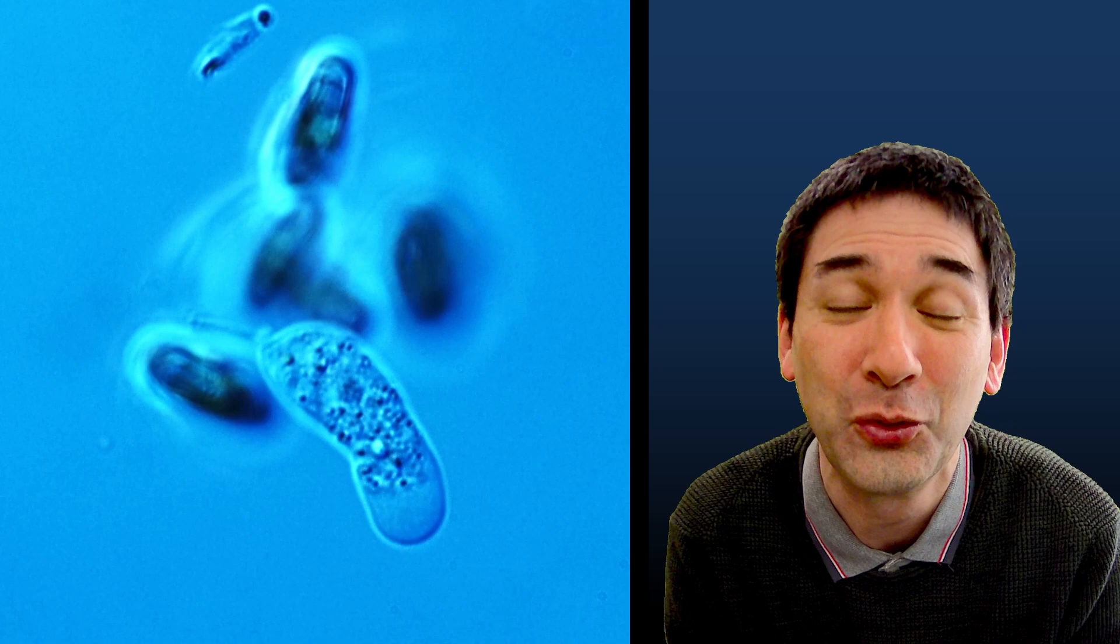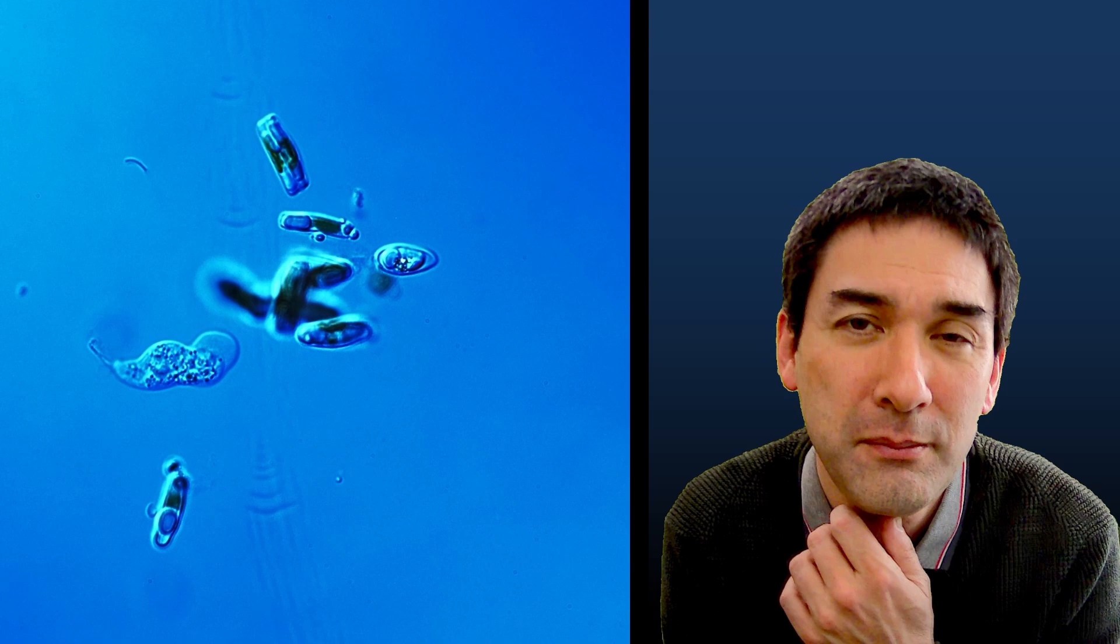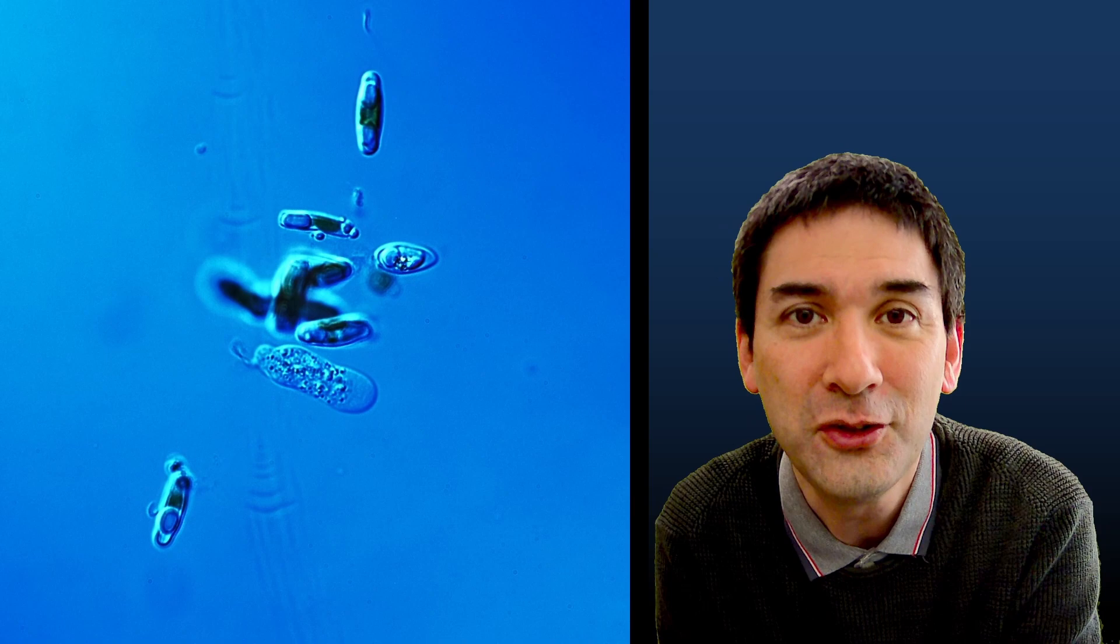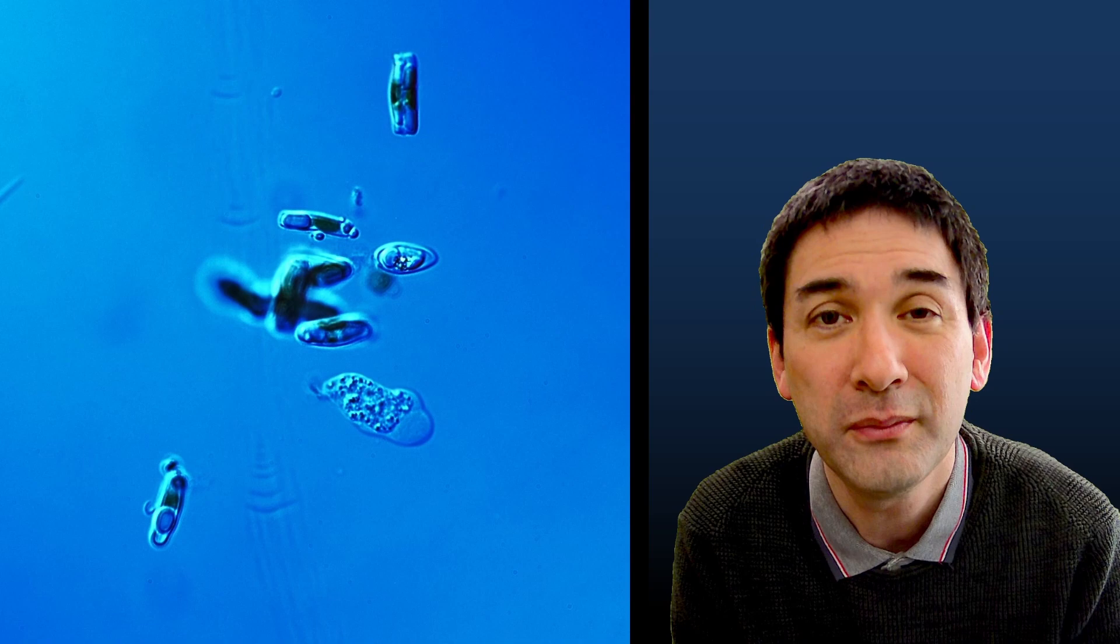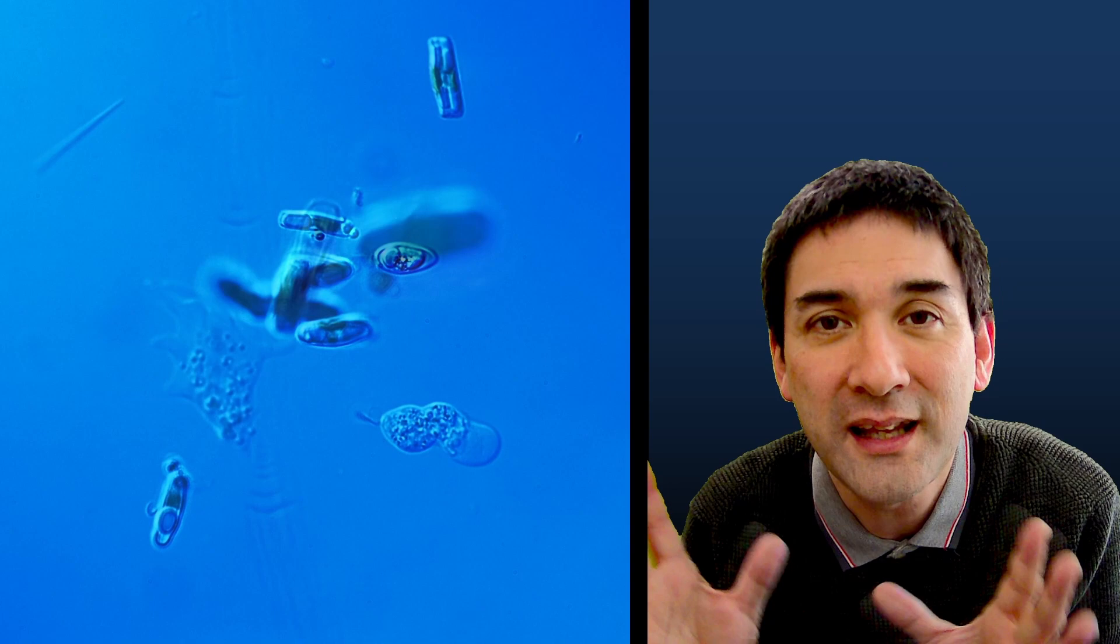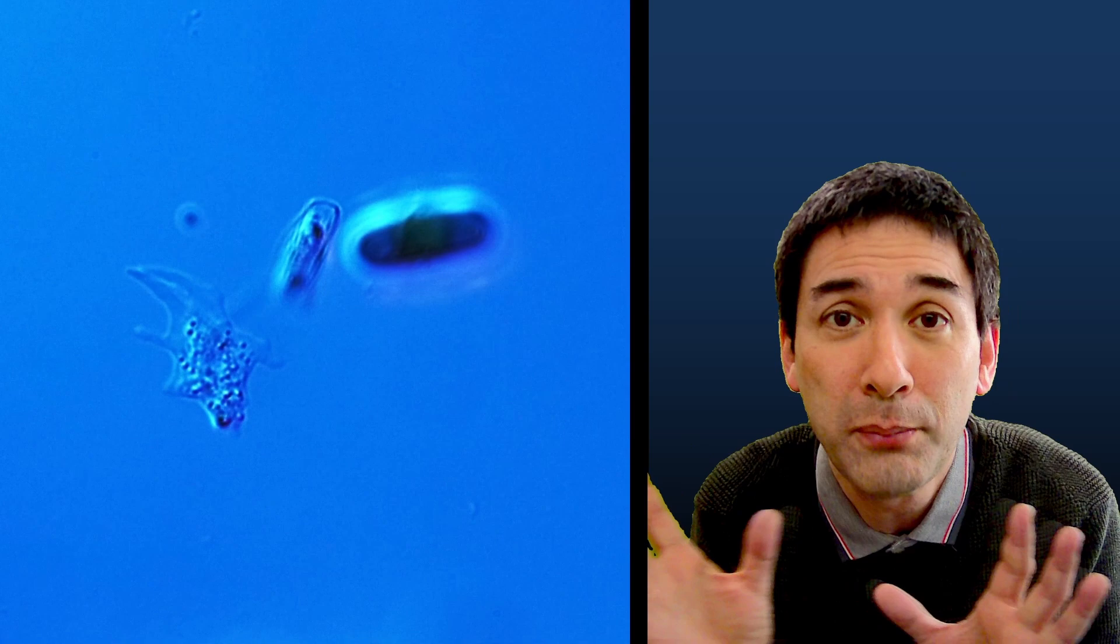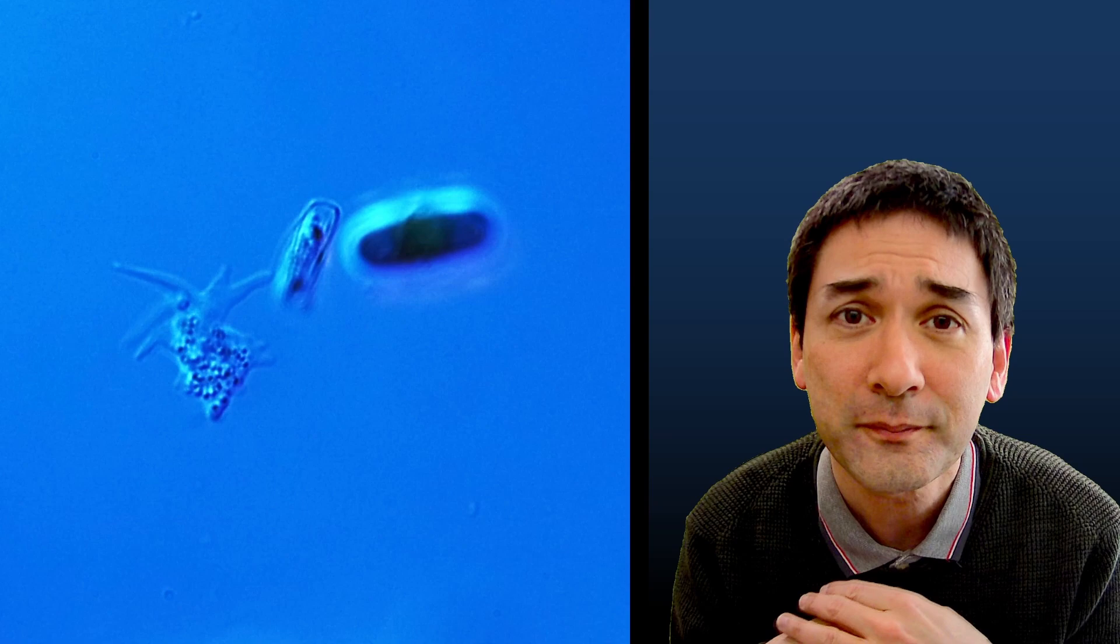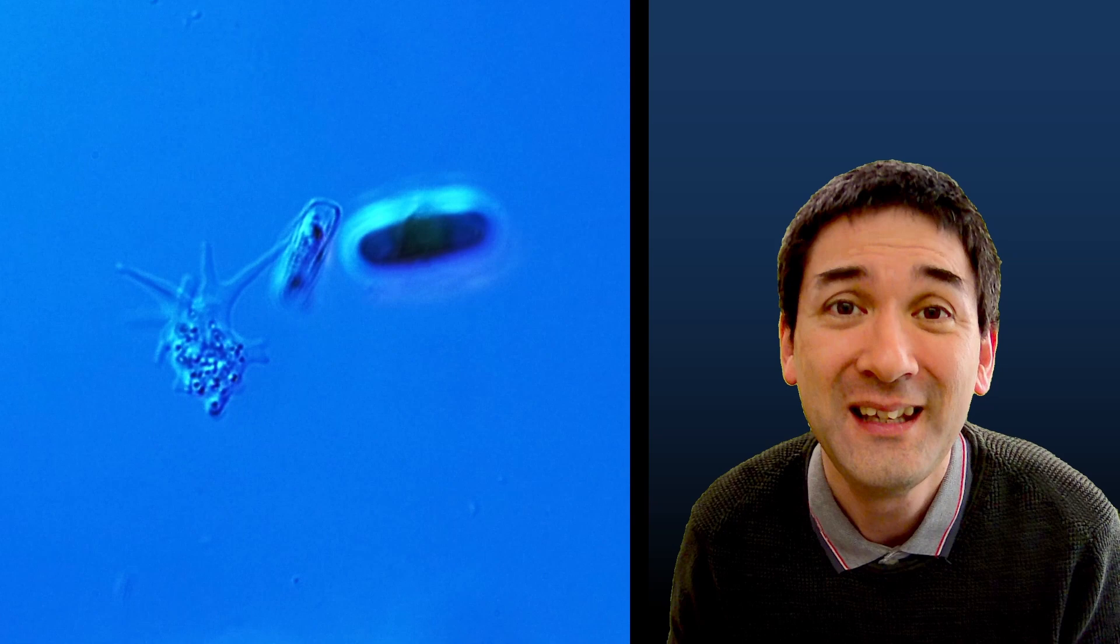And I was actually saying, well, maybe I can find some other microbes as well. And indeed, I found a few others as well. And here you see that this little fellow over here is quite motivated to go off into one direction to the right side here. But normally amoeba are able to extend their so-called pseudopodia. Pseudopodia are extensions of their cell like you have over here because that's a different one that I found. And those pseudopodia, they are kind of searching the environment to catch for some food. And you can also see that there are some smaller other particles floating around in the medium around it. So possibly bacteria and all of these things serve as a food source. And all of them can be found inside the water tank.